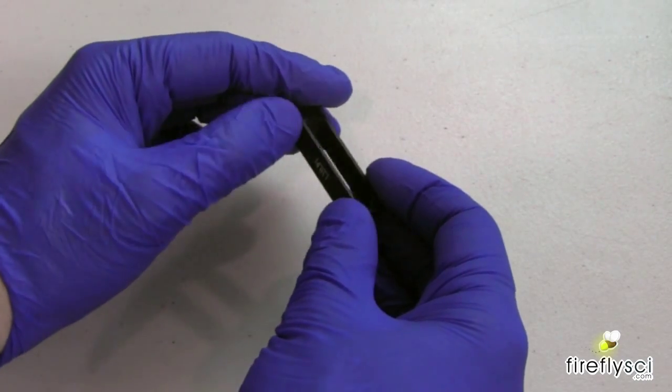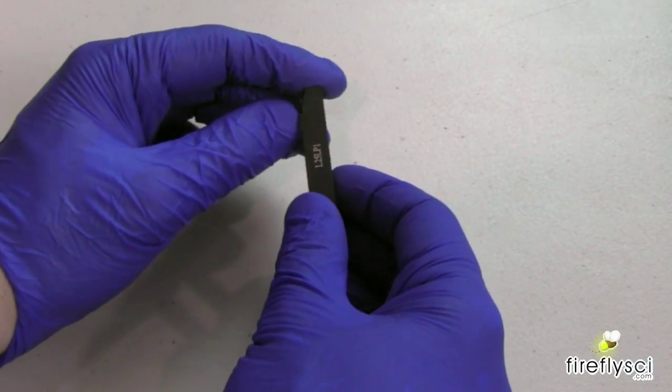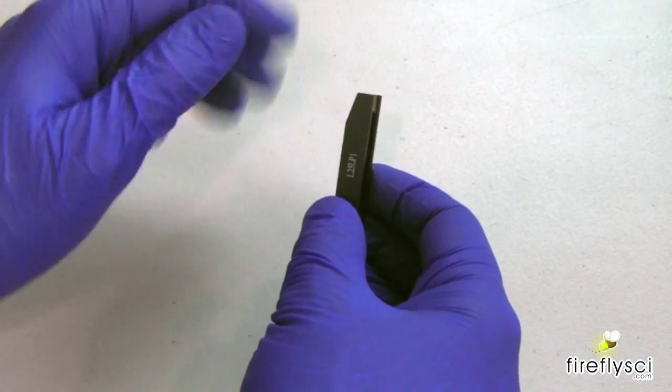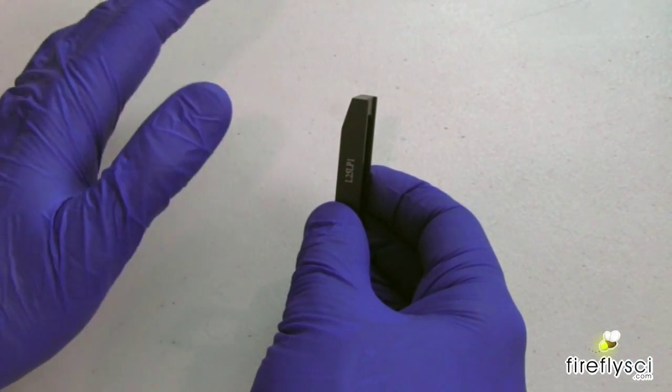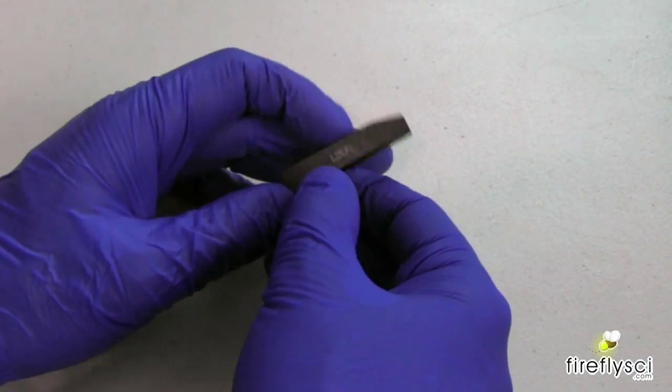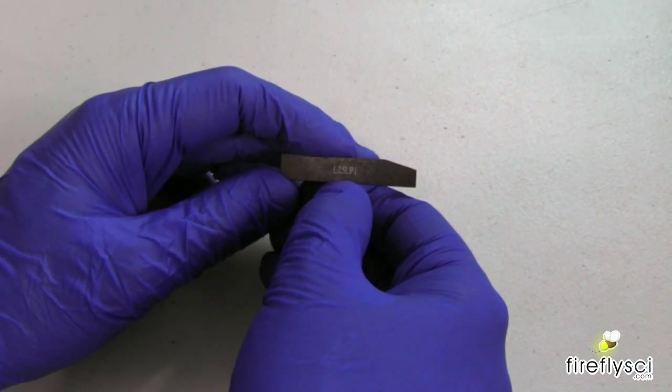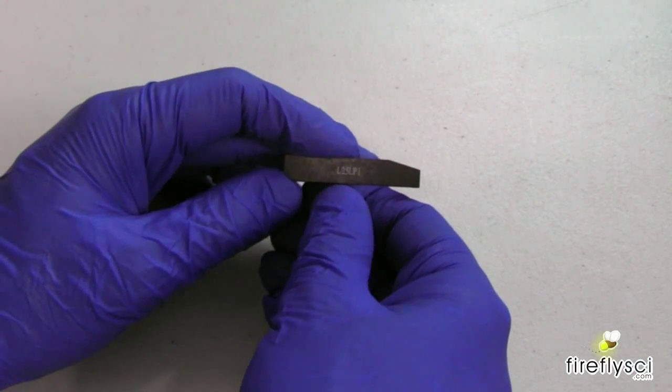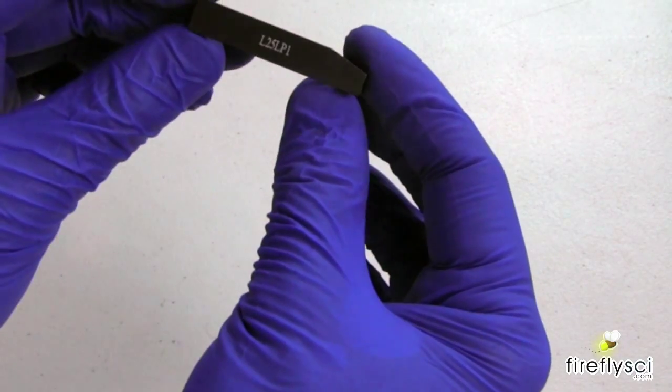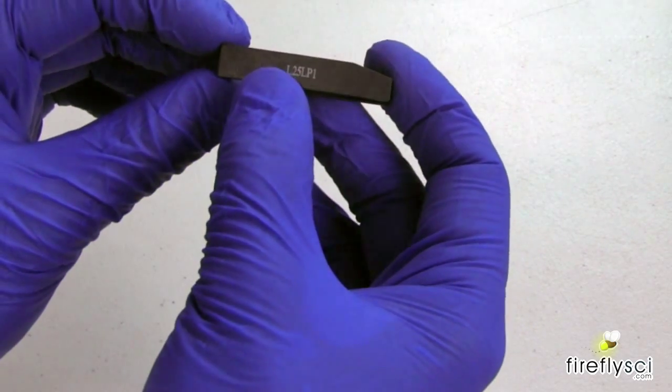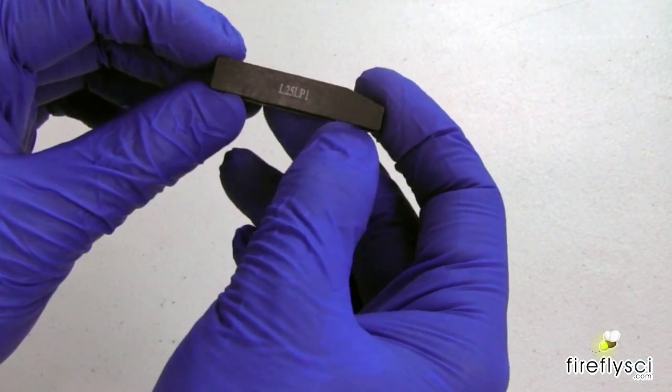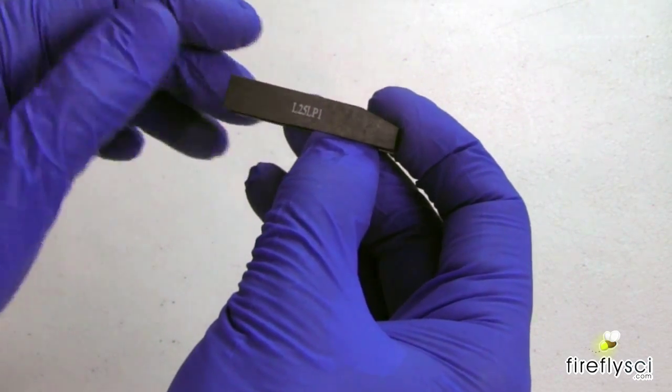So we have, these are size specific, so you have to get the right one for the size that you're using. Unlike the A20, which you could use a one millimeter, two millimeter, or three millimeter cuvette in, this is size specific. So this one that we're going to use here is built for a one millimeter cuvette. As you can see here, the part number is L25 LP1, which means the part number L25, and the light path is one millimeter. So we're going to go ahead and use this with a one millimeter cuvette.